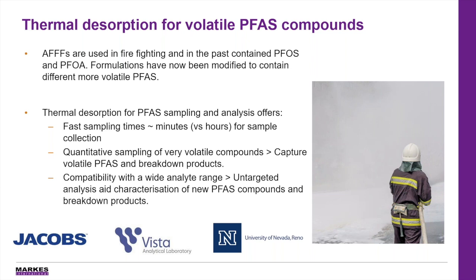toxicological point of view. Now, in a recent study between Marks International, Jacobs Labs, Vista Analytical Laboratory, and the University of Nevada, TD was assessed for the sampling analysis of PFAS from AFFFs. As the AFFF is applied, these PFAS compounds can be released into the air as well as being released into the soil and therefore the water as well. So understanding the release of PFAS from materials like this is really important.